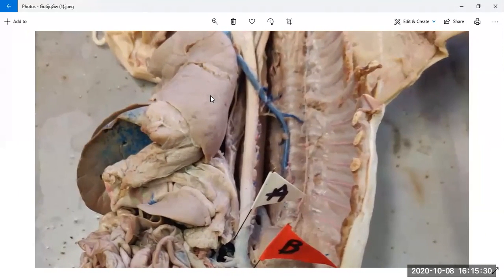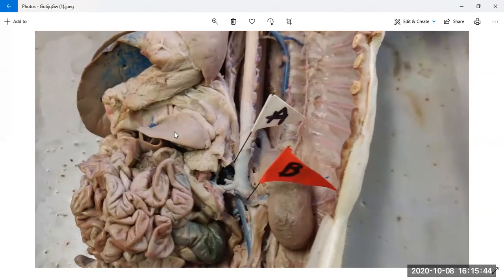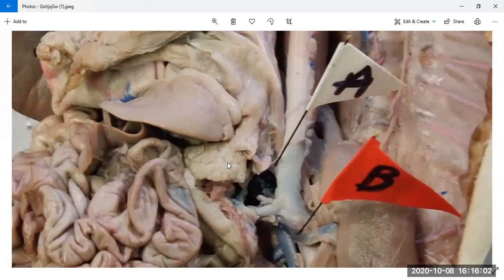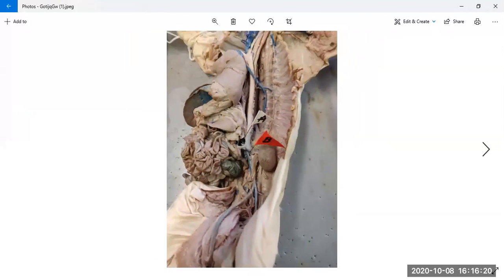Right. This one is the liver. Yes, this is definitely the liver. And over here, I don't know if you could tell, but this one looks like a tongue structure. It's floppy, and this one is the spleen, and this mushy structure has like circles, and it's clear and looks juicy, and that should be the pancreas. Pancreas, spleen, and liver. This one I couldn't tell what it is. Okay.